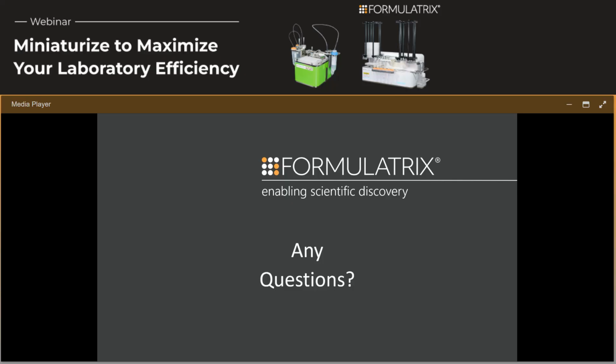Another question that comes through is, how do I validate that the reduced reaction volumes work as well as the recommended values from a kit manufacturer? Does Formulatrix partner with kit manufacturers to publish data showing that there is no detriment to data quality?